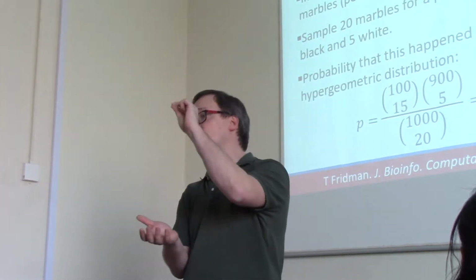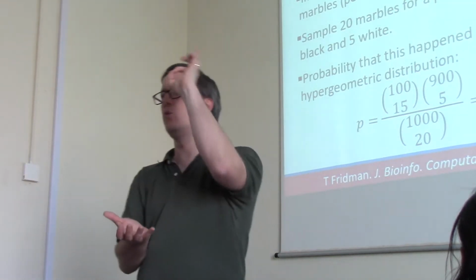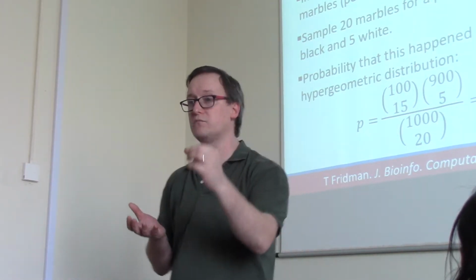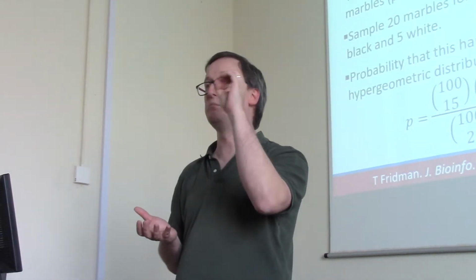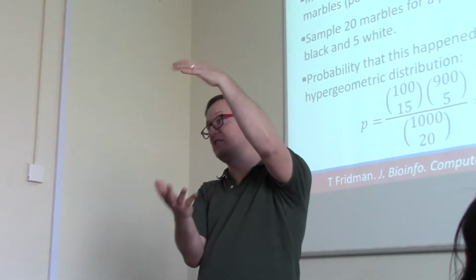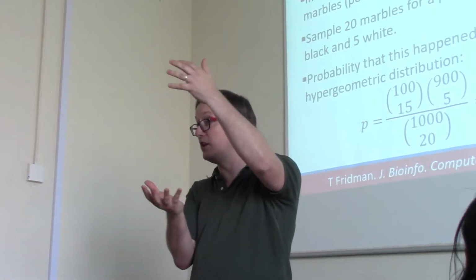At some locations where you could have had a peak, you didn't see one. So you just write the mass to charge value on a white marble and chuck it in the jar. Some places you did find a peak. So maybe at 876 we did have a peak. So we'll write that on a black marble and put that in the jar. So when you shake it all up, this jar has a pile of white marbles, places where you saw nothing, and a bunch of black marbles that reflect places that you did.